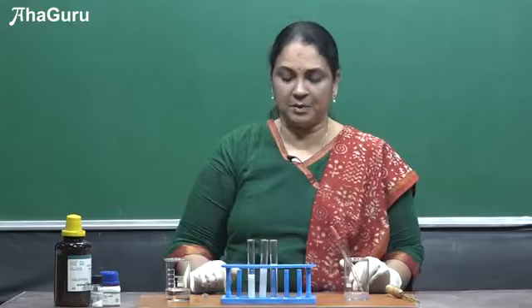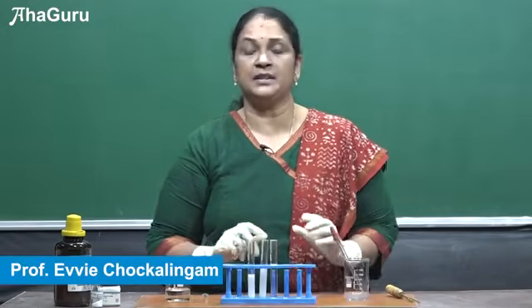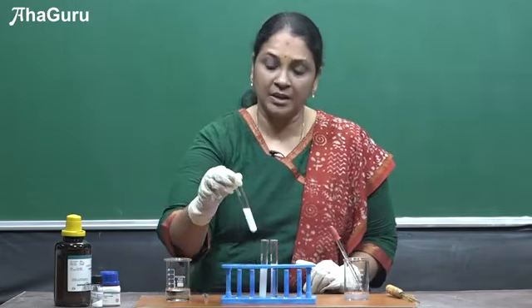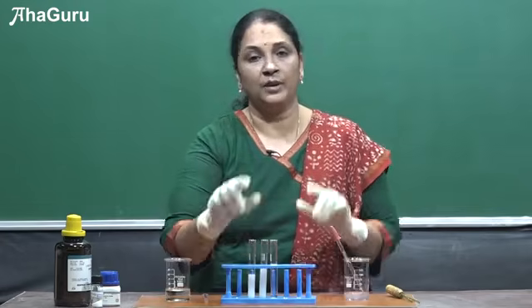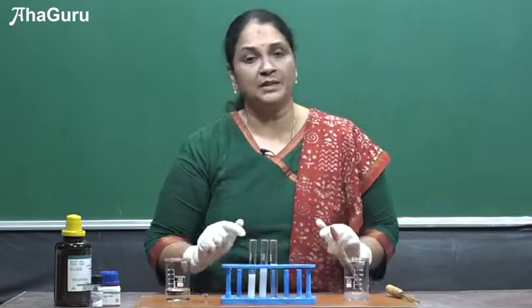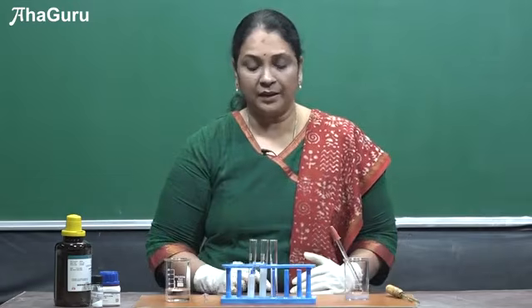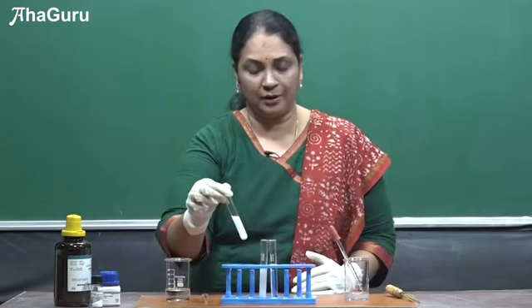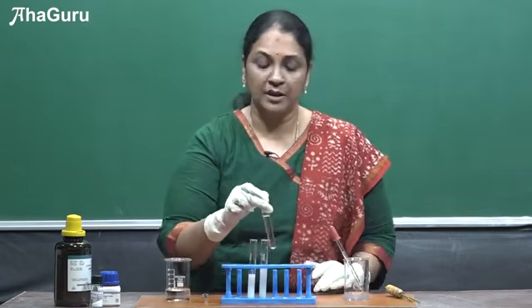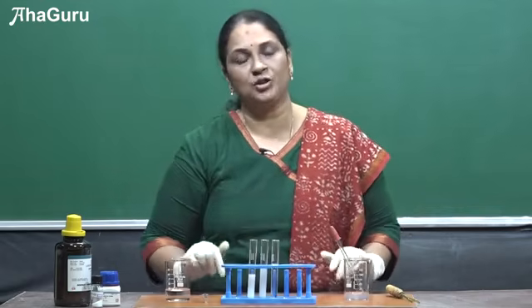Now let us see the concept behind this. As per Fajan's rule, if the anion is bigger, it will have higher covalent character. Here you have the AgI precipitate, and the iodide anion is bigger, so it will have more covalent character. When it has more covalent character, it will be insoluble. To break the bond will be very difficult, so it is insoluble in ammonium hydroxide. Whereas AgCl precipitate is completely ionic, so that is why it is soluble in ammonium hydroxide. I hope you enjoyed the experiment.